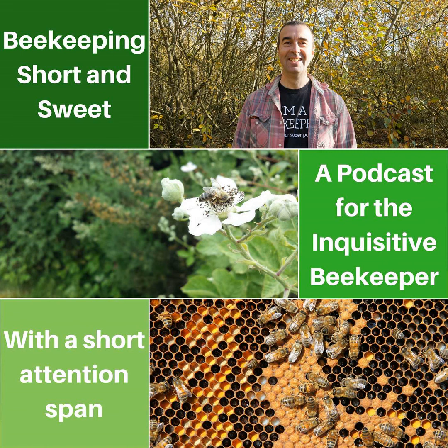One of the interesting aspects that I've been approached recently about is pollen identification in honey samples and the provenance of the honey, knowing that it's local, knowing that it's been produced by their bees in their back garden, but also being able to say, oh, my bees have been foraging on blackberries, or they've been in that field of oilseed rape. And we can do that with these microscopes, can't we?